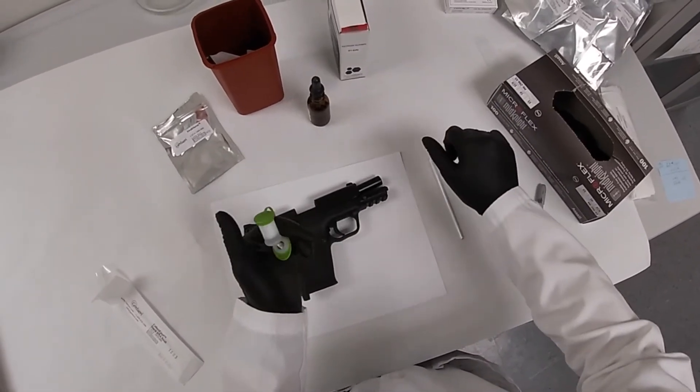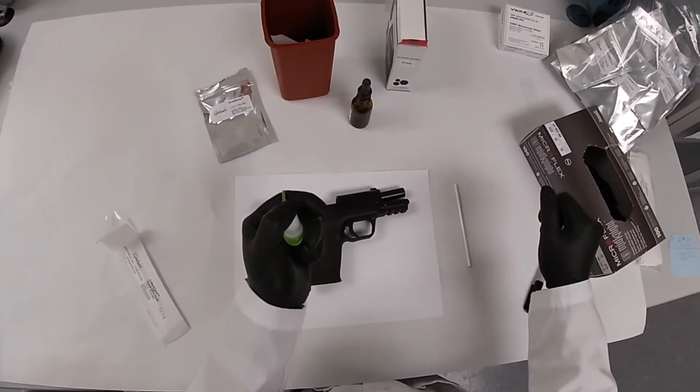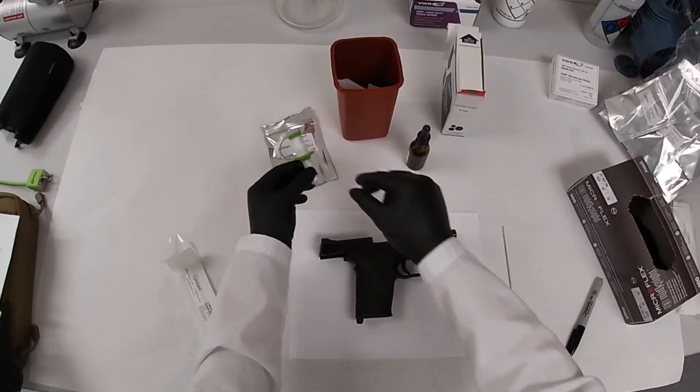Close the cap of the swab saver by putting your fingers under the collar and using your thumb to push down on the cap, ensuring it is snapped closed.